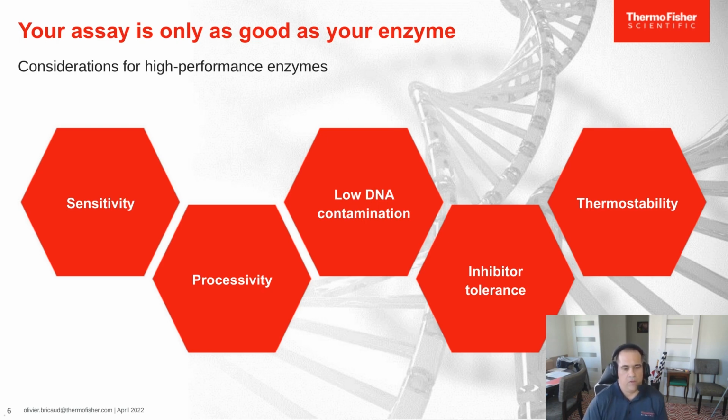The main considerations when we think about enzymes are sensitivity, processivity, and inhibitor tolerance. We don't want any false negatives because of the presence of an inhibitor. Also thermostability, because we mostly deal with PCR workflows where there's a wide range of temperatures.